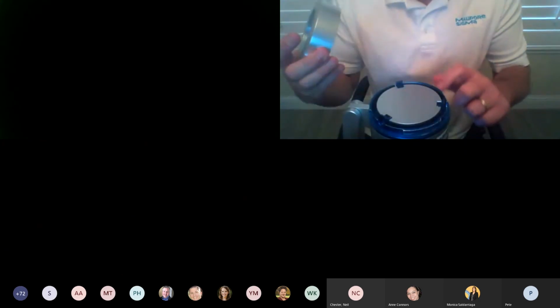And that's also what you'll need to replace. After about 5 years of really consistent use, what's going to happen is your head is going to start to stick more. And so when you do your calibration check, just have a look at that ring. See how the head fits. If your users are saying, I've got to crank this head to pull it off, then this blue ring needs to be replaced. It could be the head too.